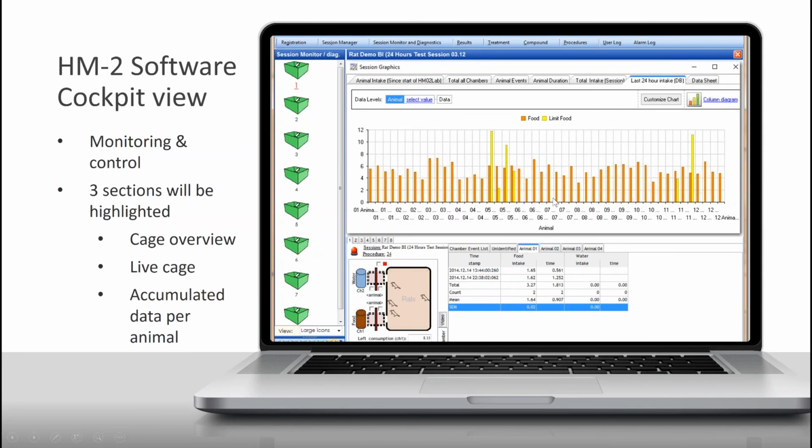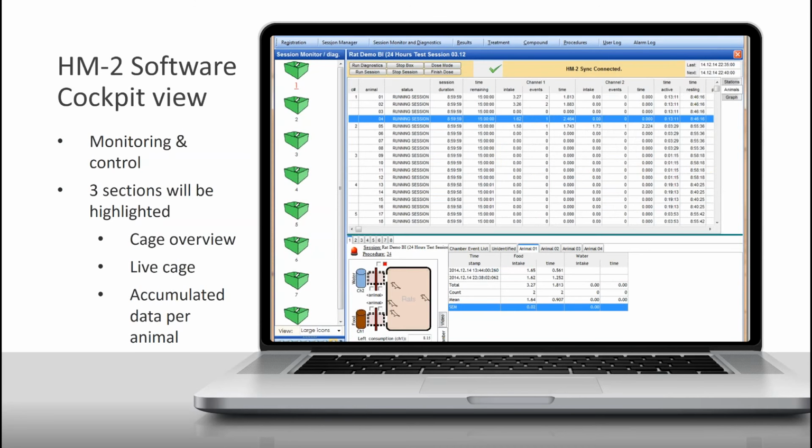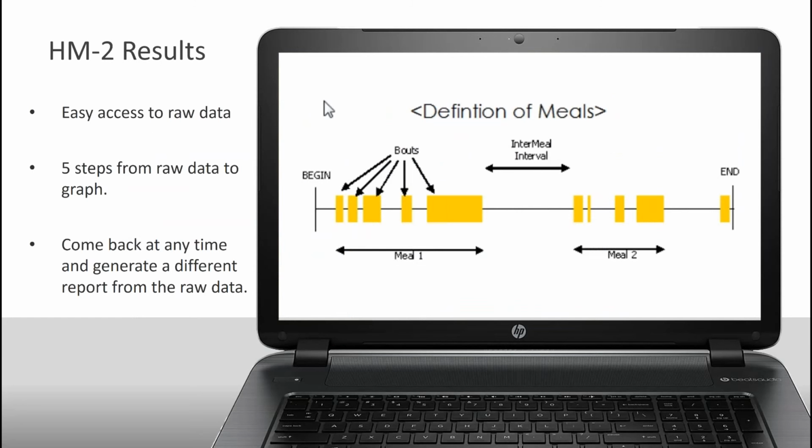The last thing about this is you can see a red bar as well. You would see a red bar here. This means that there's an unidentified event going on. So maybe a wrong animal has been placed, an animal has been placed in a wrong cage, or maybe a tag is missing. We don't see that very often, but of course we can't predict human error. So this is just to tell you that it's a good quality monitor and health monitor as well for the animals.